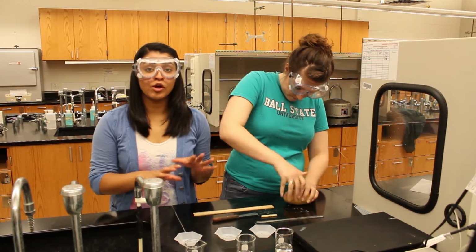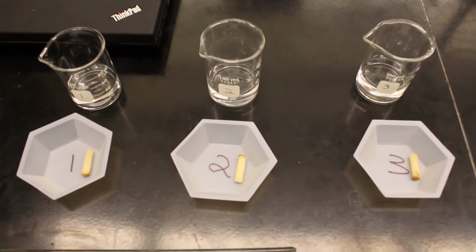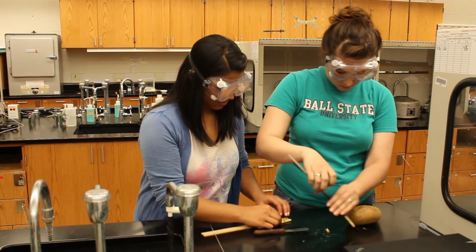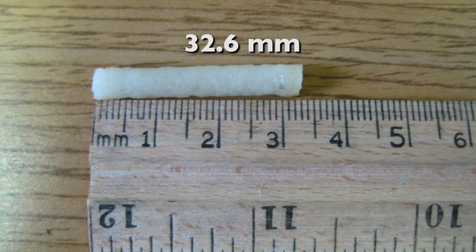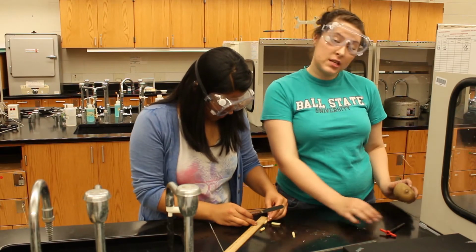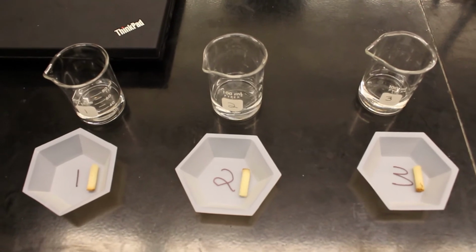Make sure that you label all your weighing boats so that you do not get everything mixed up. And also, when you're recording your masses, make sure you measure up to 3 decimal places. After you've recorded all these measurements, you'll want to place each of the potatoes into their respective solutions. Now, they'll need to stay in these solutions for 45 minutes.